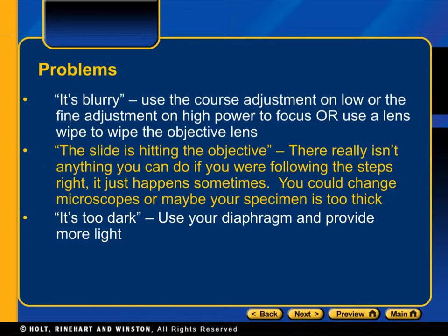Another problem is the slide, or the objective is hitting the slide. I think that's written wrong. There really isn't anything you can do. Maybe your specimen is too big and it's too thick or something like that. So most likely you will have to change microscopes or thin out your specimen.